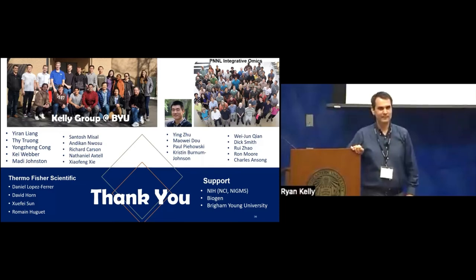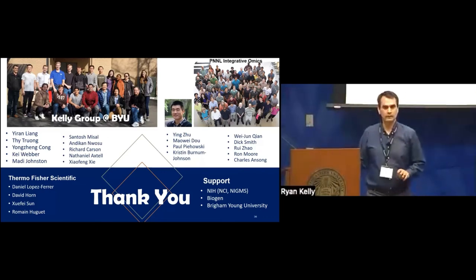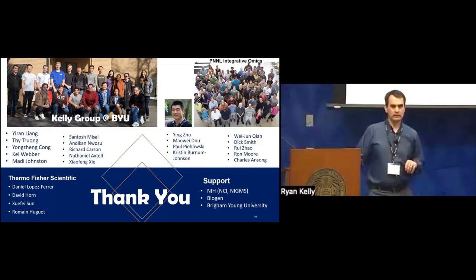Can you please provide more information about your optimization steps in increasing the performance of matching between runs? You mentioned these weird issues where you start seeing hundreds of features identified in your blank runs. How do you control for false identifications and quantitations by decreasing the PPMs, mass accuracy, retention times, and have you figured out a reliable way to apply match between runs without bringing any concerns?